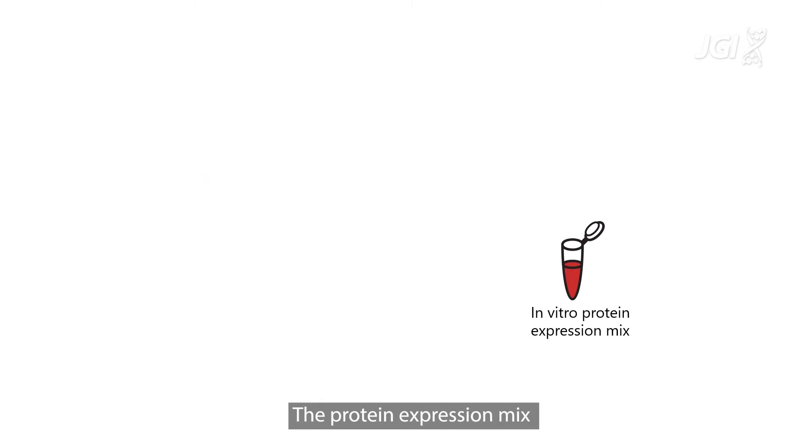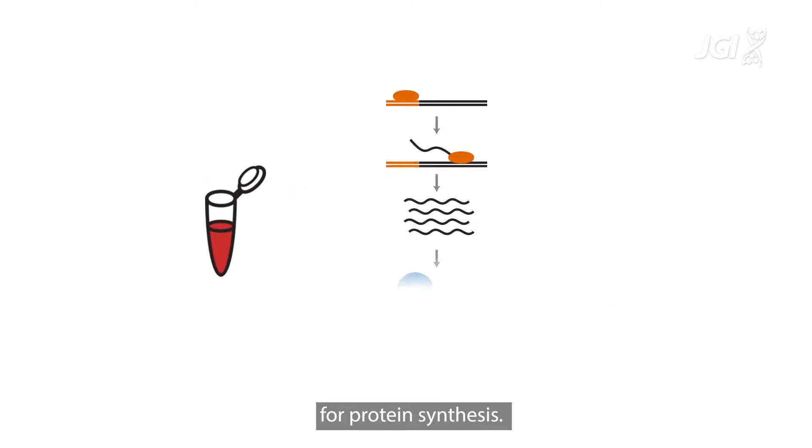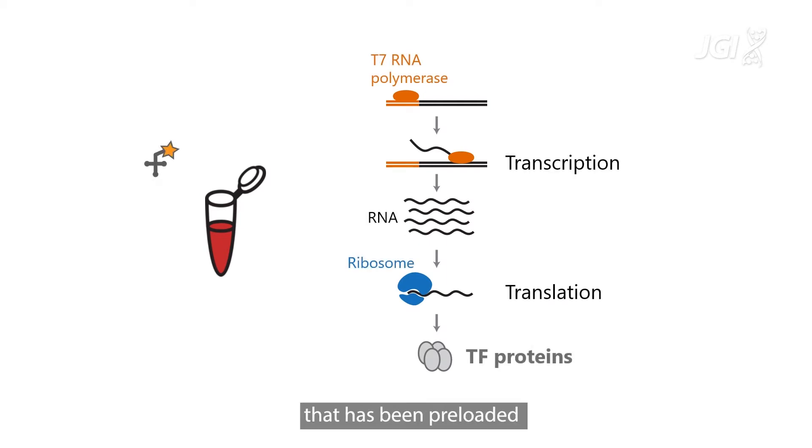The protein expression mix is an off-the-shelf product that includes all the necessary components for protein synthesis. But we also spike in an additional reagent, tRNA that has been preloaded with biotinylated lysines.